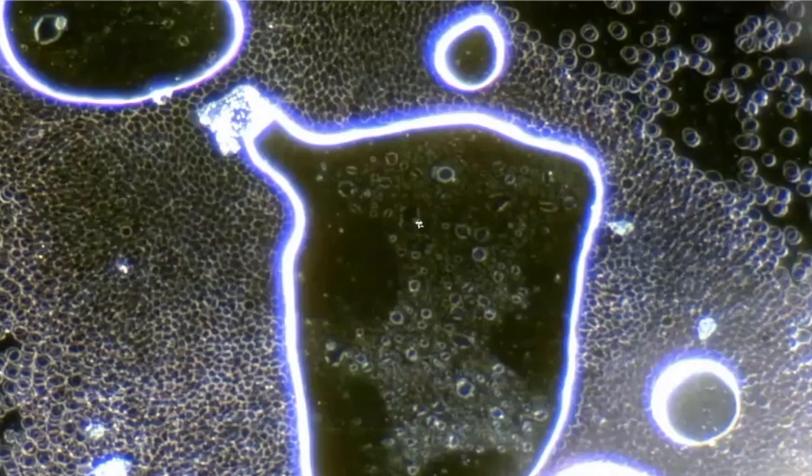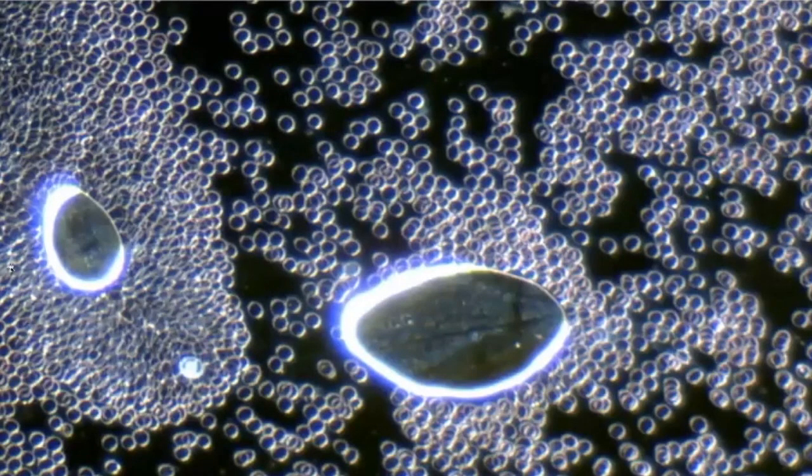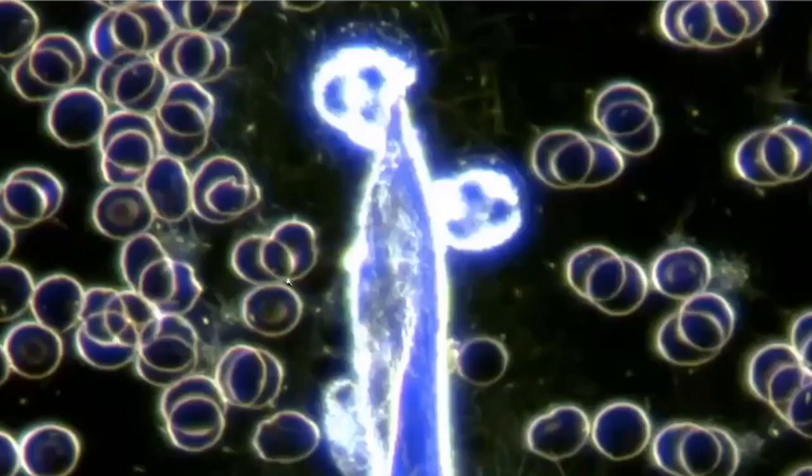So here is what's been named as a polymer hydrogel construction site. We know that they do have a specific charge, a very positive charge, and this causes the cells to become attracted to each other, to agglutinate, to coagulate, and you can see what's happening around these structures in this particular person's blood. Again, here's another example of that. And we also get what we call hydrogel structures. These are quite familiar for people who've been looking at this work recently.